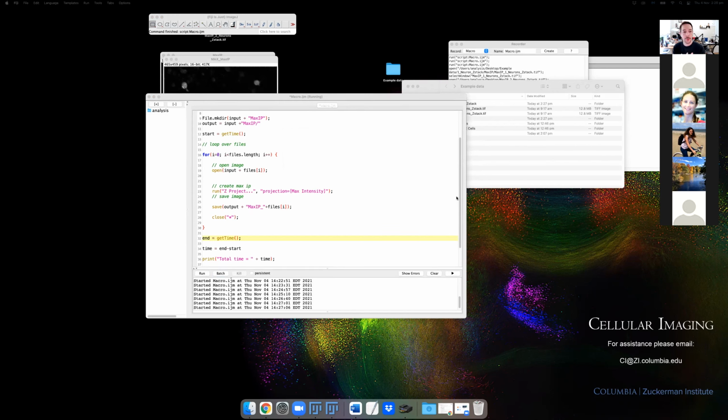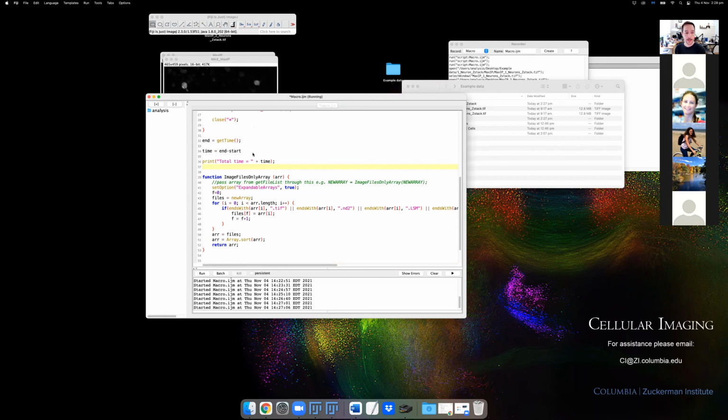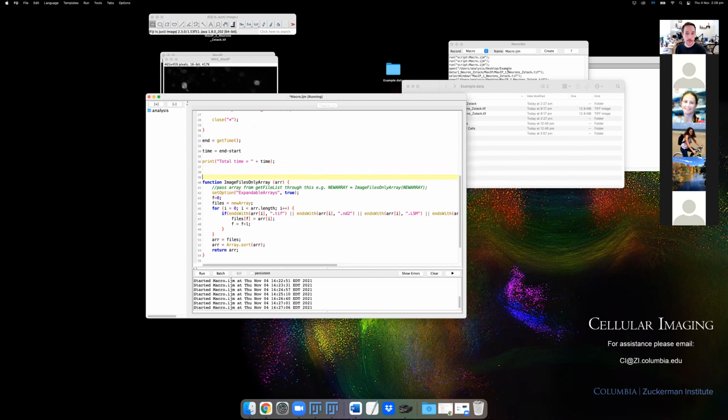So whenever we want to do something in scripting, if it's complicated or it's multiple lines and we're going to be doing it repeatedly, we don't want to have to keep writing that every time in various parts of the script. So what we do is create a function, and this is a good example of a simple function. And the way these work in ImageJ macros is you put them at the end of the file. So I can just paste this into the bottom of the macro.